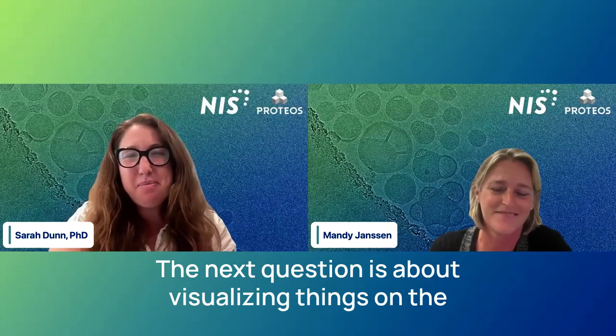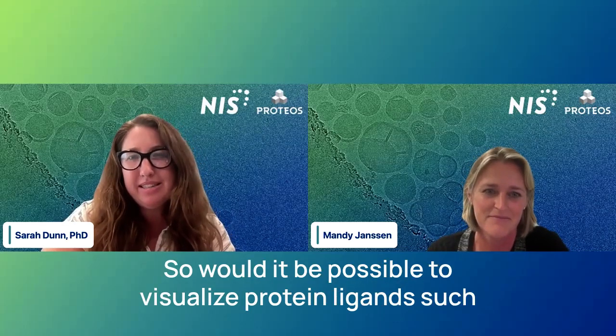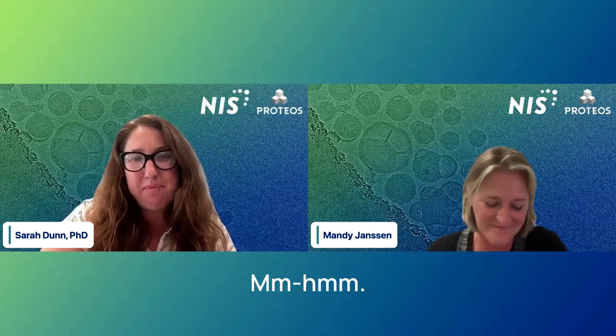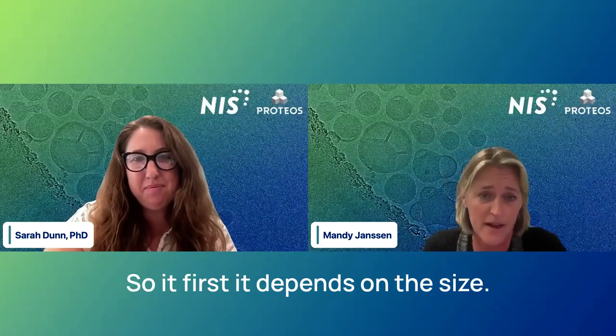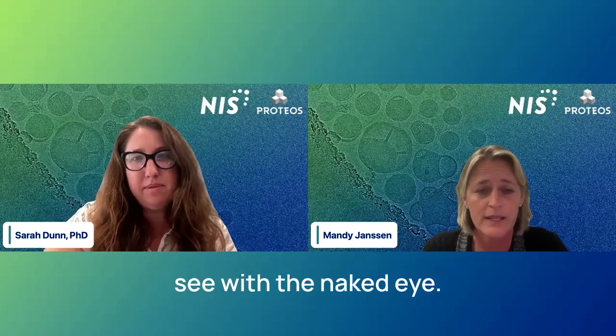The next question is about visualizing things on the outside of these LNPs. So would it be possible to visualize protein ligands, such as antibodies, using cryo-TEM? Another good question. Yes and no. So first, it depends on the size. Entities like a Fab would be way too small for us to see with the naked eye.